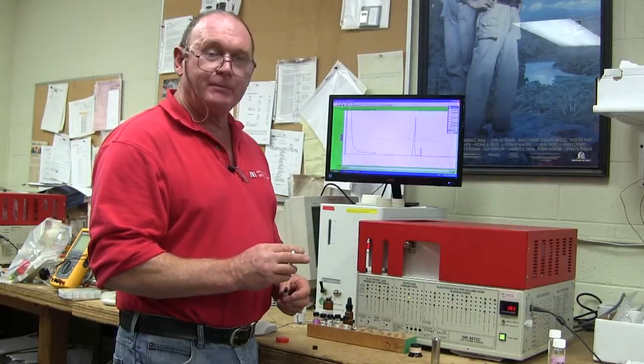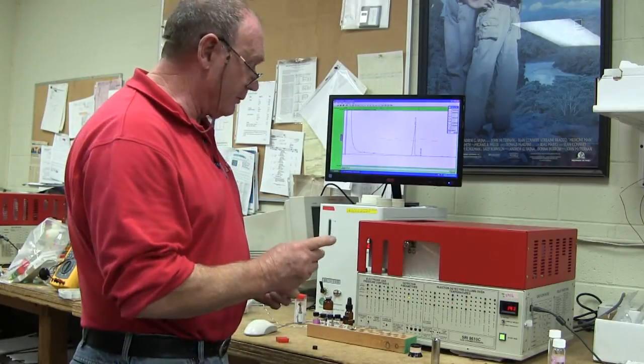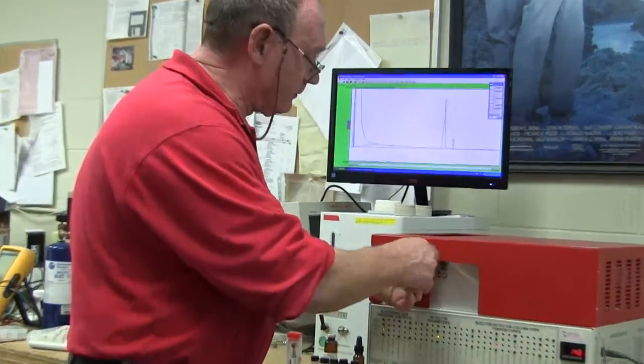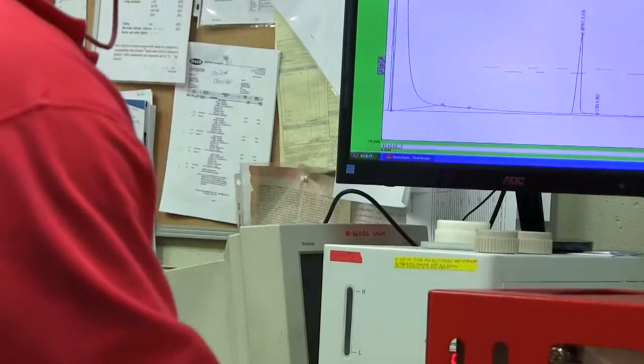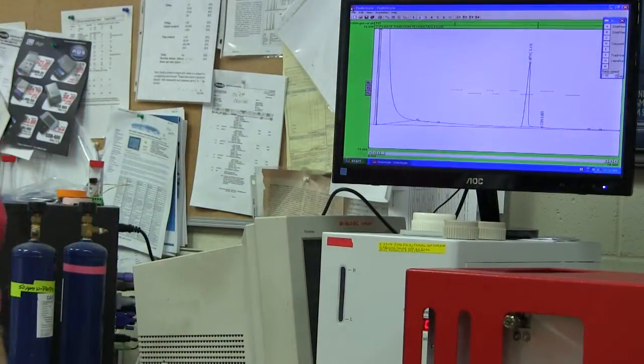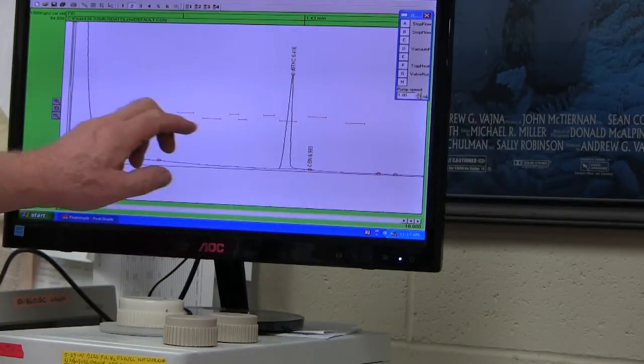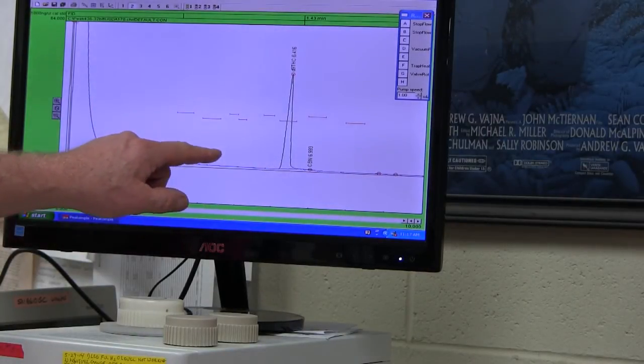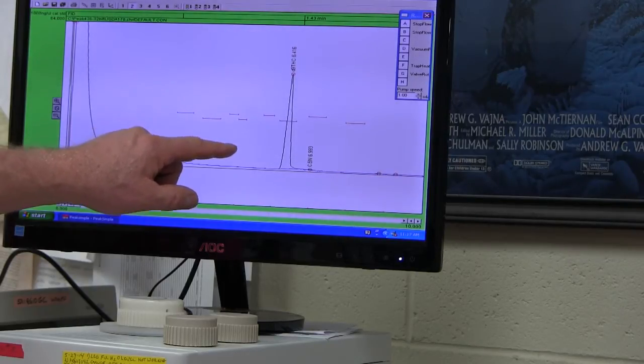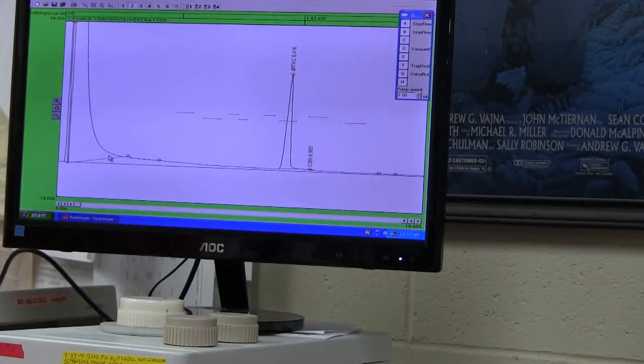So the next step is to get the THCA standard and inject that into the GC with no prior derivatization. So here I'm going to do that. And that results in a chromatogram that looks like this. So the THCA peak will decarboxylate in the heated injector of the GC, and you will see a peak that comes out at the same time as the delta-9-THC standard.